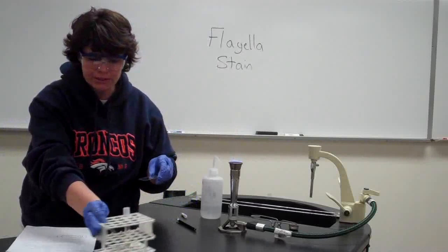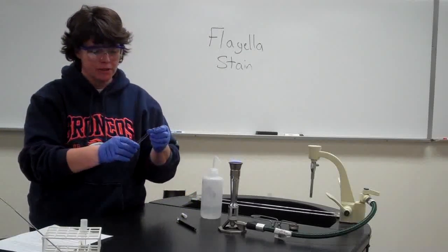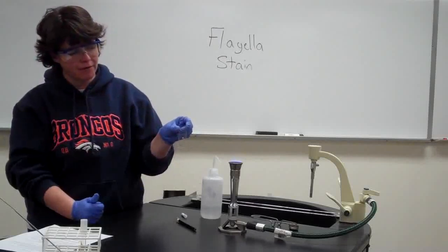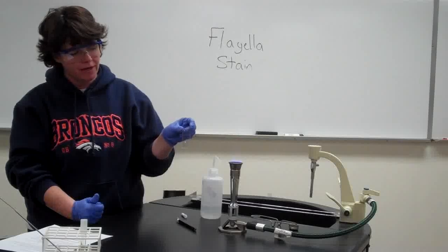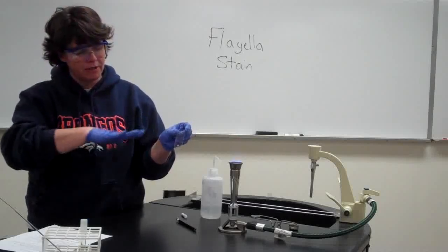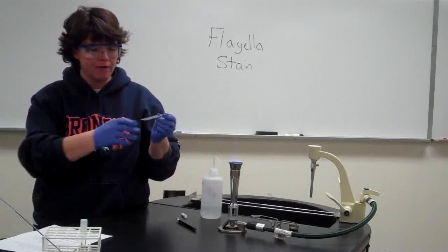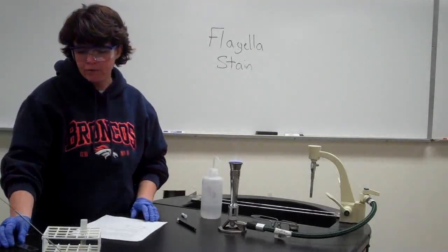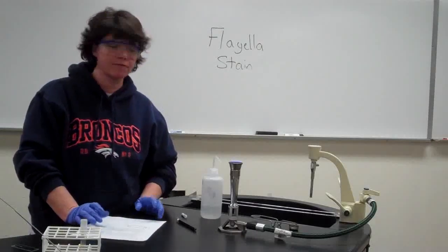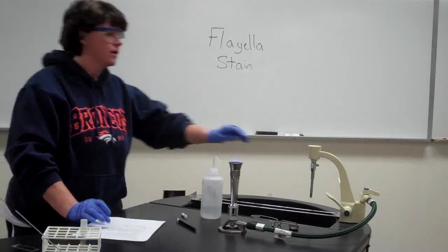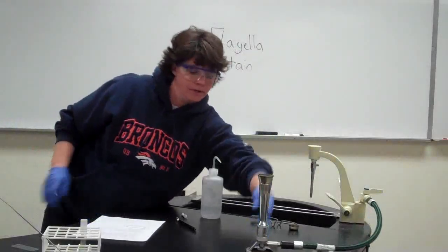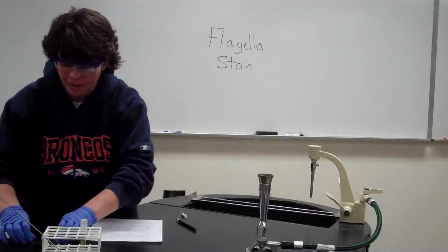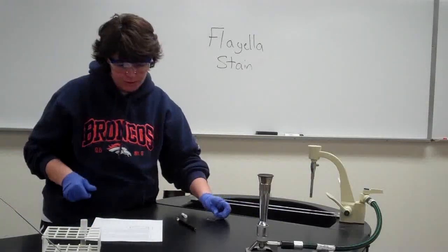Flame your loop. Then tilt the slide so the drop of water runs to the other side — don't mix it. Instead of spreading with a loop like other stains, just let it run down; as it runs it spreads the bacteria out into one layer without breaking the flagella by mixing. Allow this to dry at room temperature — there's no set time limit, just allow it to dry completely. Since we're not heat fixing, we don't need the flame anymore.